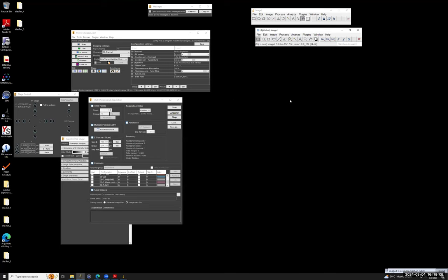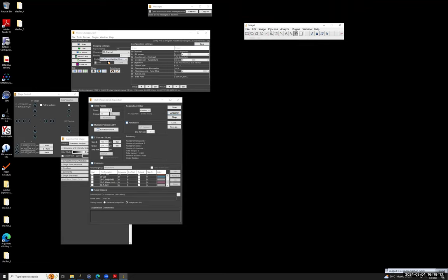Okay, so now that I touched on ImageJ and Fiji, you may have noticed that when I open Micromanager, there is also ImageJ that popped up. So Micromanager and ImageJ are integrated, which is very useful, because it also allows you to do some on the go processing of the images as they come from the camera. In Micromanager, you can run something on them in ImageJ. Maybe if we have time later, I will show you something in that.